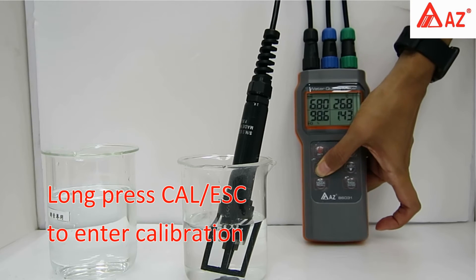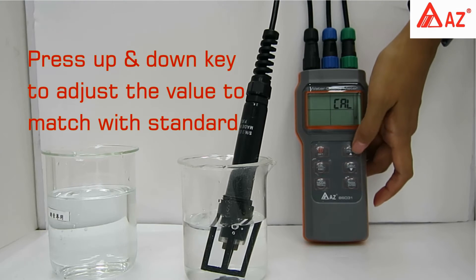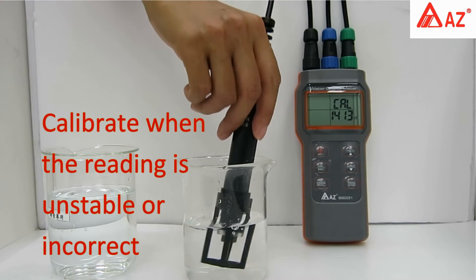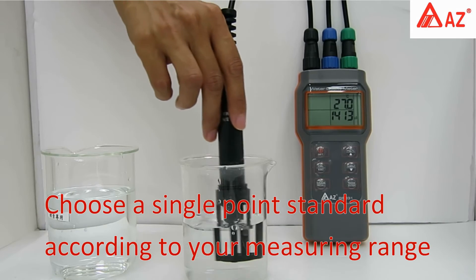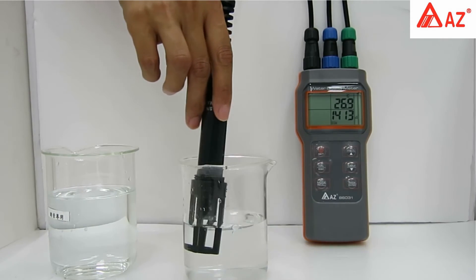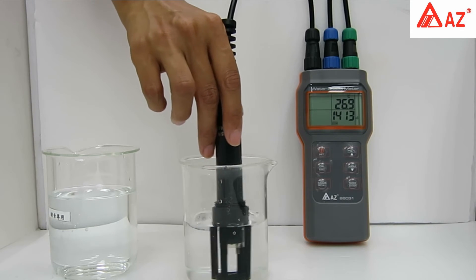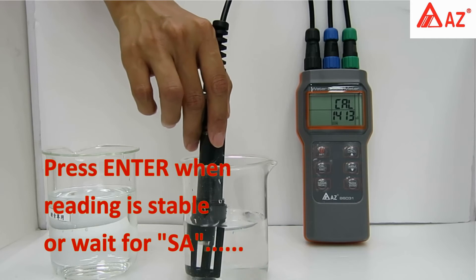Long press the Cal/Escape key to enter calibration. The probe will automatically detect — press the up and down keys to adjust the value to match the standard. Perform calibration when the reading is unstable or incorrect. Standard buffer should be discarded after one-time use. Only a single-point calibration is needed — choose an appropriate standard according to your measuring range. Once the reading is stable, press Enter or wait for the SA icon — the result is automatically saved.